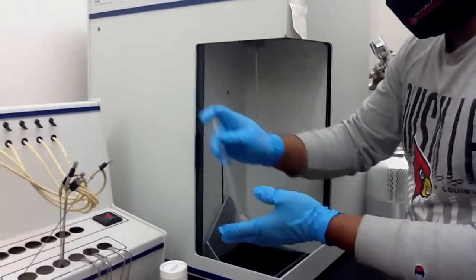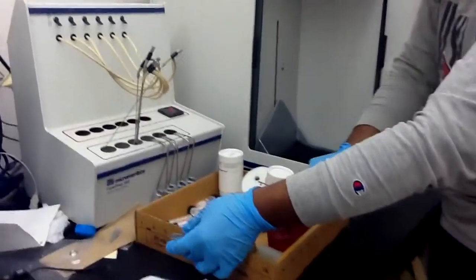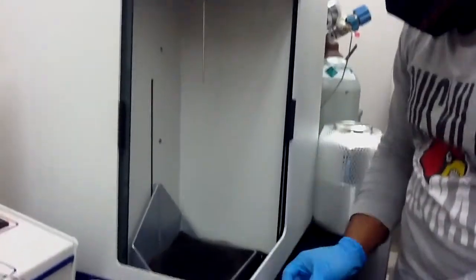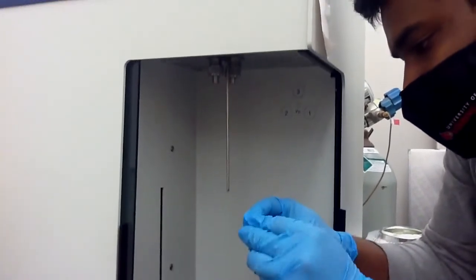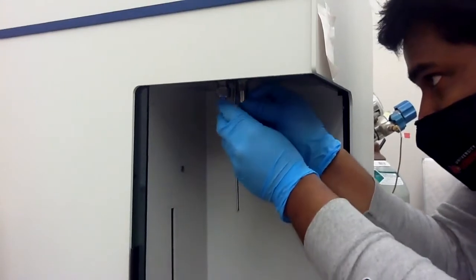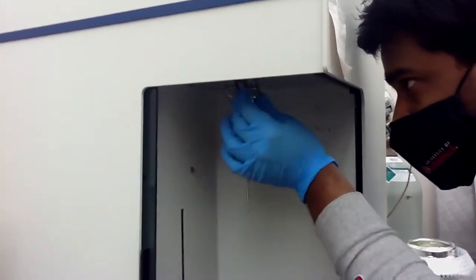And if you want to dry this, you can just put it here and set the temperature at 150. Another thing you also need to do is keep this hole closed. So for this one, put this tube here, put the ring at the top like this, and just close it like this.